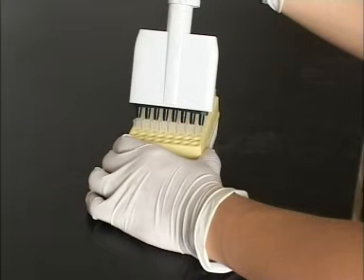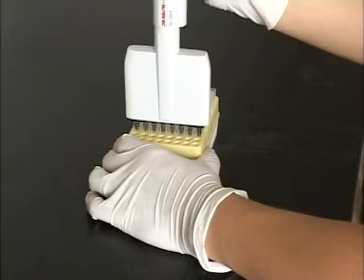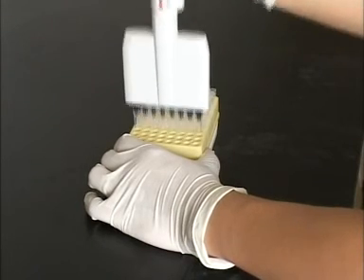Multi-Channel Pipette: Push the tip cones simultaneously into the tips. Use a back and forth or a side-to-side rocking motion to ensure that the tips are securely fitted.